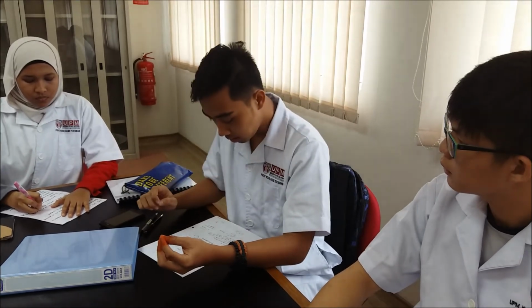After that, we just put in test 1, which contains a sample, and then test 2, which contains a sample, and the result shown on the machine is what we're going to record, and that is what we're going to calculate in our experiment.